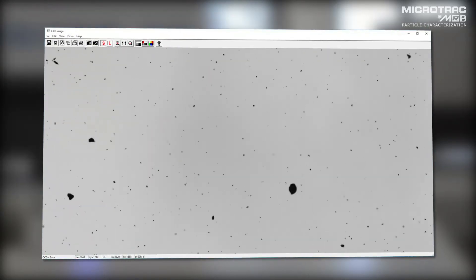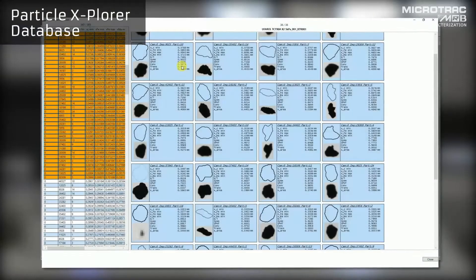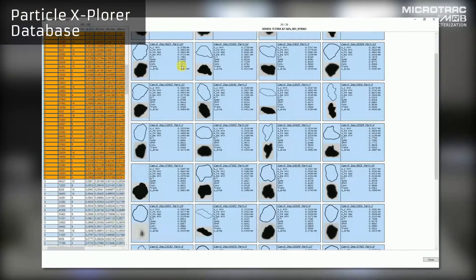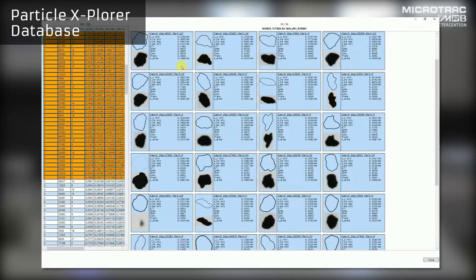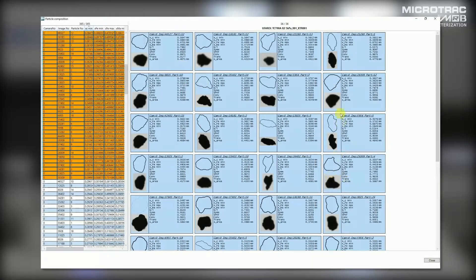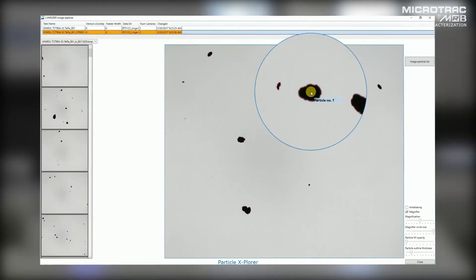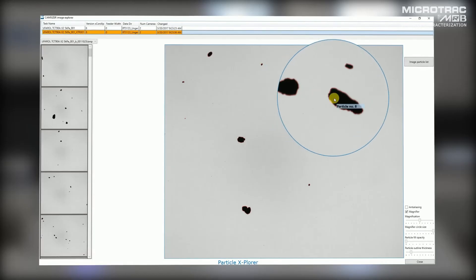Seeing is believing — individual images can be saved and imported into the particle explorer database, giving the operator a better understanding of the material at hand. All characteristics of the respective particles can be retrieved at a later point in time.